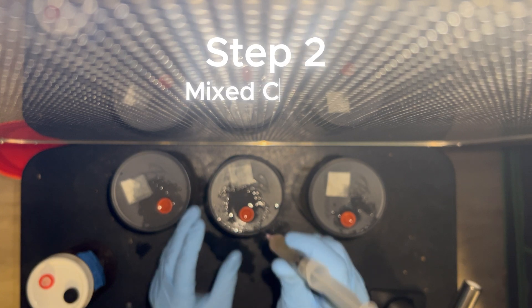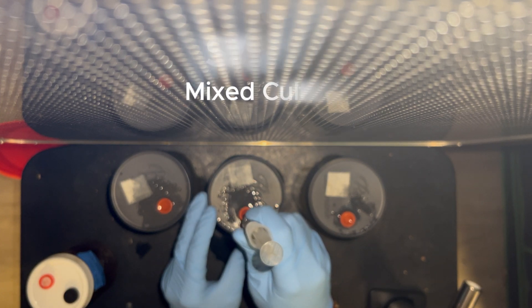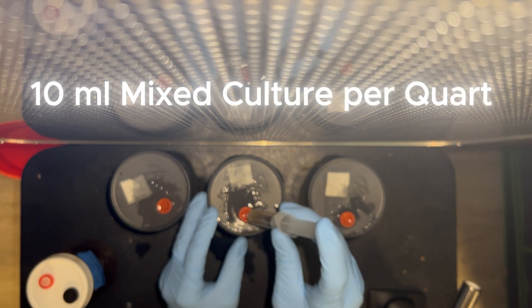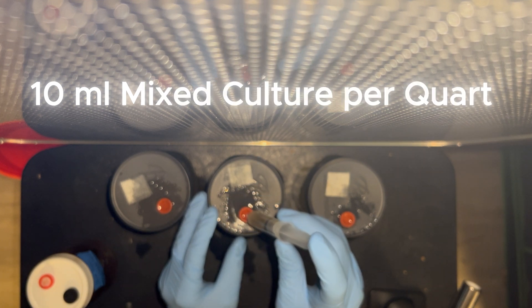The next step is to use that mixed liquid culture to immediately inoculate grains. Use about 10 to 15 milliliters per quart jar to inoculate the grains. Once that colonizes, you have grain spawn to be used to inoculate sawdust or substrate — whatever you want to do with it. And that's about it for the spawn production.